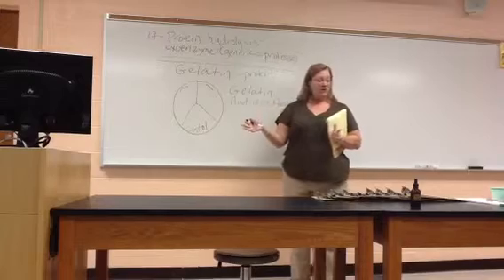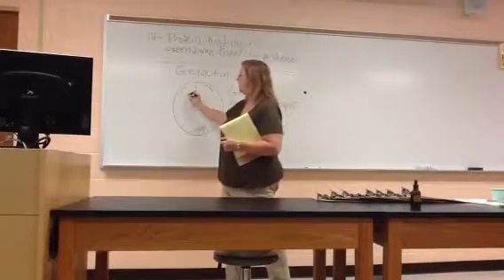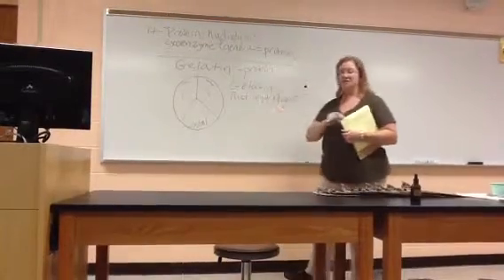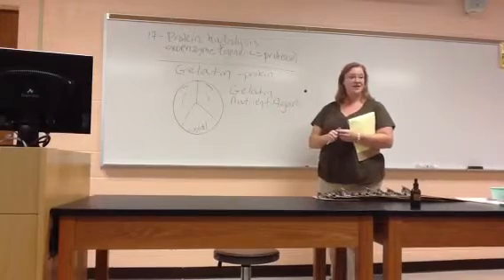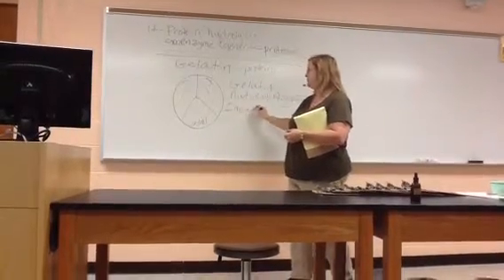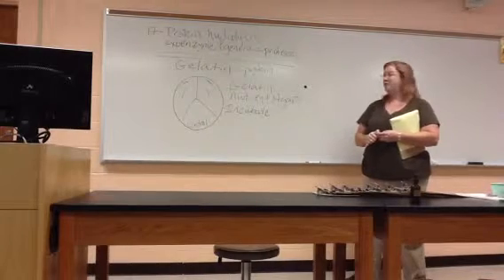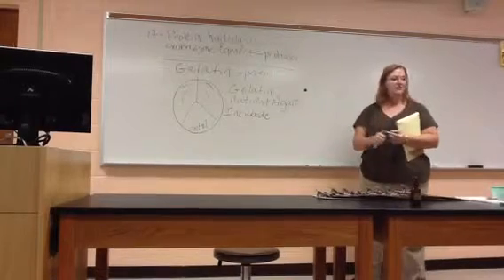But once you find out what they are, aseptic technique, right, flame the opening of the tube, and you're making one short straight line, just like you did last Wednesday, of that bacteria in its specific section. And again, that's all you do today, right? Inoculate it, get it in the incubator, same time and temperature, right? 37 degrees, 18 to 24 hours. And then after incubation, because gelatin is sort of a tan color on its own, we're not going to be able to tell if they've eaten it or not.